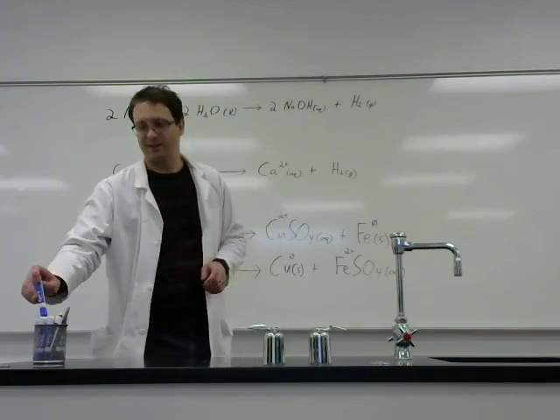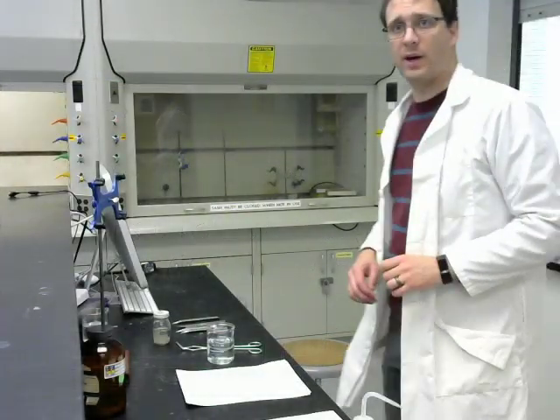So anyway, let's get started. Okay, for these first reactions, we're going to be looking at how metals will react with water.